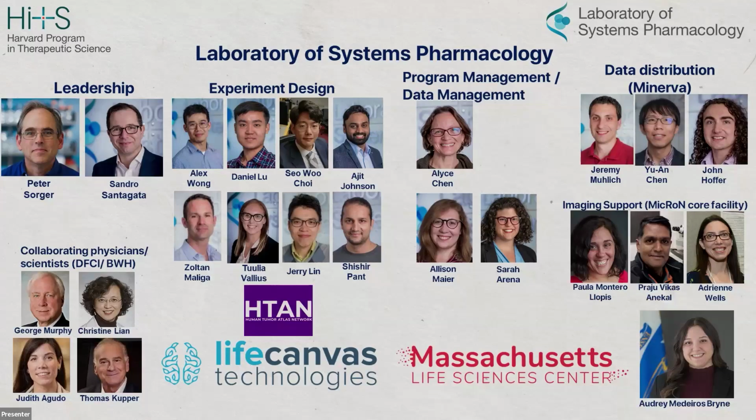3D imaging is more complicated, and it requires a dedicated core facility team to guide instrument usage and design validation experiments in a scientifically rigorous manner. The Micron facility is headed by Paula at Harvard Medical School and has an amazing team and impressive selection of microscopes.